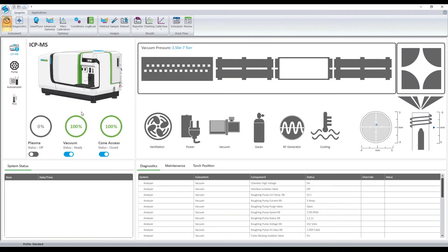Syngistics was designed with your workflow in mind to make it as easy as possible to use the software. The software is a ribbon-based environment that works from left to right.